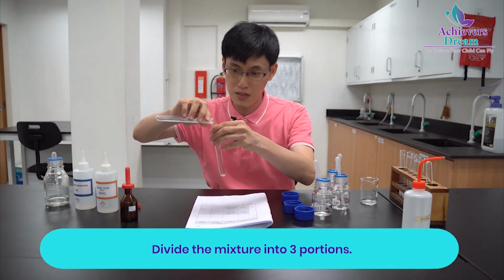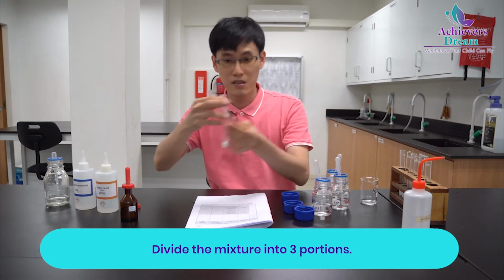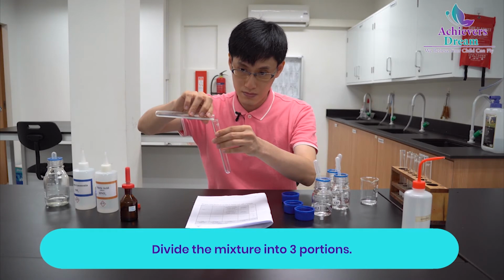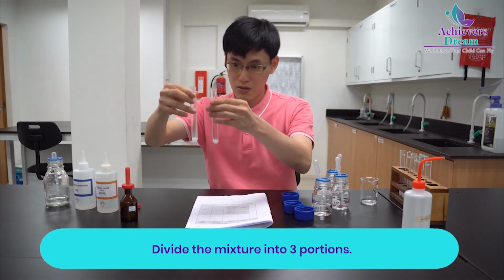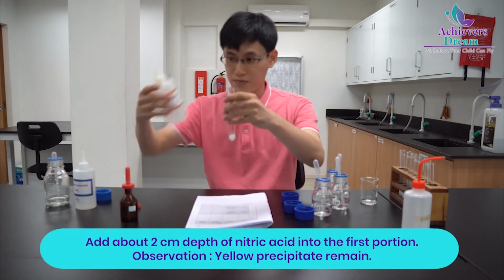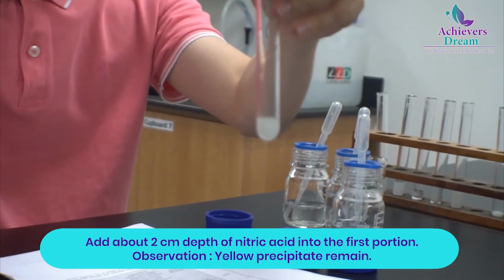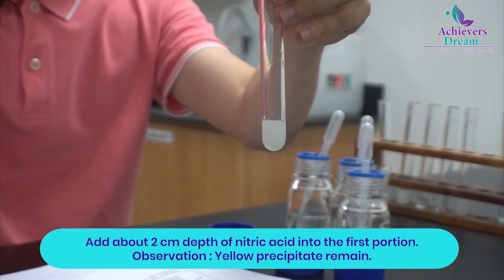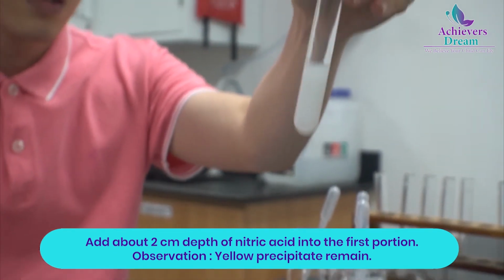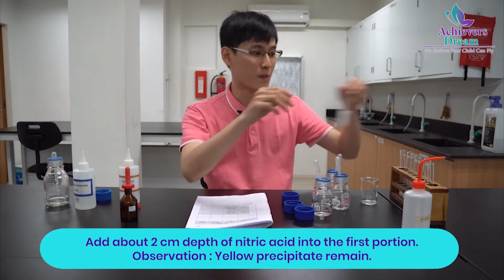A little bit here and a little bit here. Okay, so let's add a bit of nitric acid now and see if the precipitate dissolves. Okay, here goes. Nothing's happening. The precipitate is still there. Solution is still cloudy. Silver iodide is insoluble.